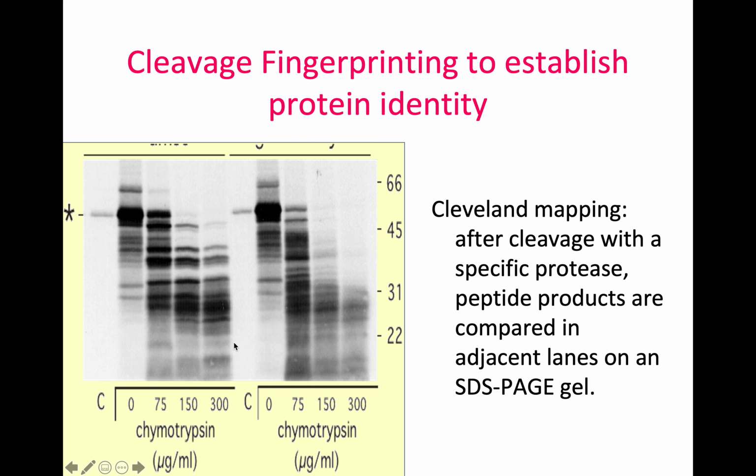Usually after you have cleaved your protein, when you run the gel, you don't want to see all these bands up above. You want to see kind of dark masses or bands down here, or none. Usually no bands is also quite good, meaning that it has been cleaved quite efficiently, meaning that it's too small to be visible on your gel. But it could also mean another thing, meaning that probably everything has been degraded.